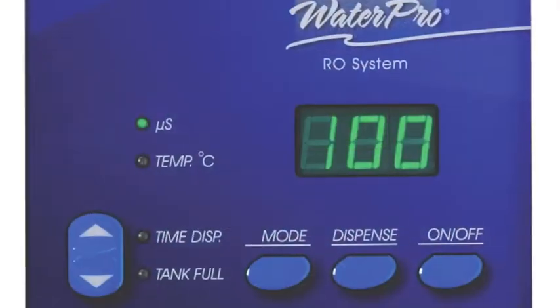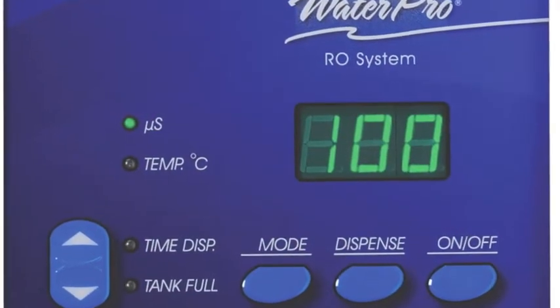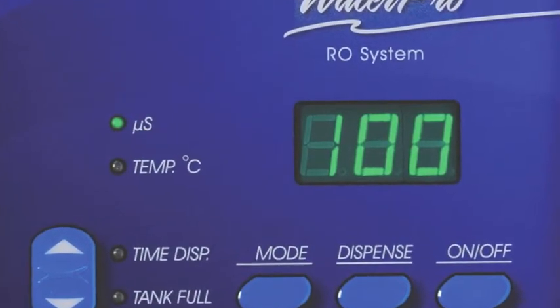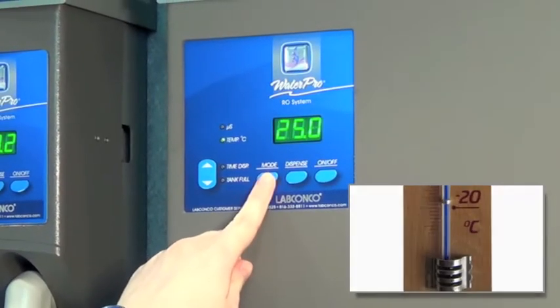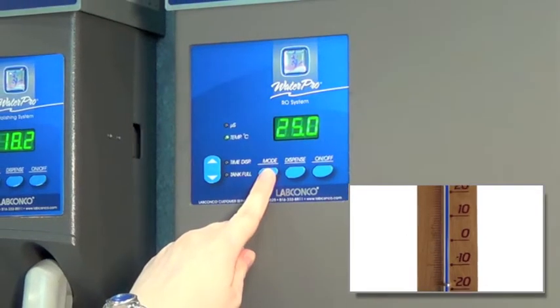When microsiemens is selected, the water's conductivity and the unit of measurement appear on the LED display. The temp selection displays the water temperature in degrees centigrade.